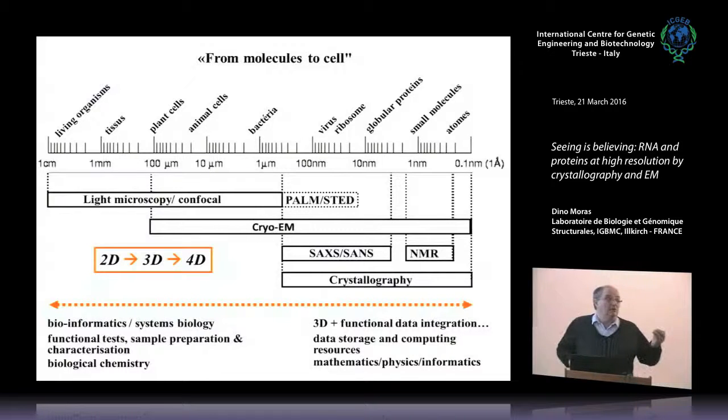Today, when we talk about structural biology, we are not talking only about crystallography. That was the field of crystallography, you see. From 1 angstrom, I showed you, even better, to a few angstrom resolution. That was the atomic resolution only. Cryo-EM used to be in that field, and now that's a bit optimistic, but okay, it is at that level.